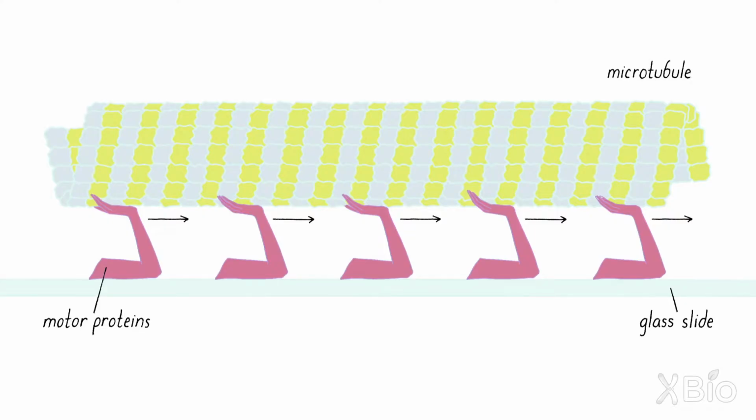After we overcame our amazement and surprise by that result, we then began to piece together in our heads what might be happening. Maybe that soluble protein fraction that contained some agent that was causing the organelles to move actually contained the motor itself. So the soluble protein fraction had motors that were floating around in it without the organelles, and these motors would also be able to stick onto the surface of this glass slide, grab hold of the microtubules, and transport these microtubules along the glass.